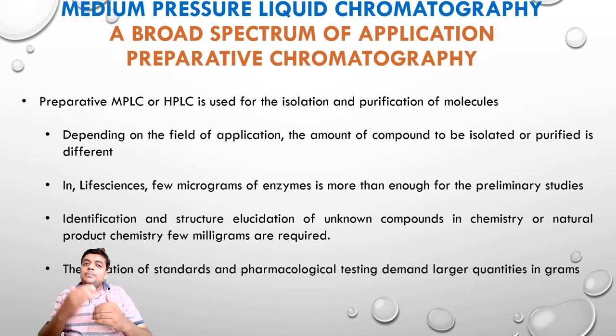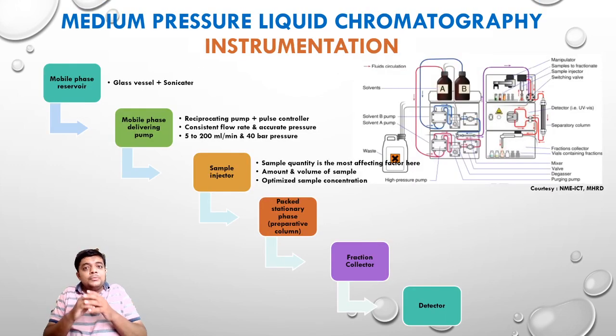And yes, medium pressure liquid chromatography, although it works on a very simple principle like HPLC, has a fundamental base of preparative chromatography. Now, the instrumentation part of medium pressure liquid chromatography. Again, it's the same kind of instrumentation.